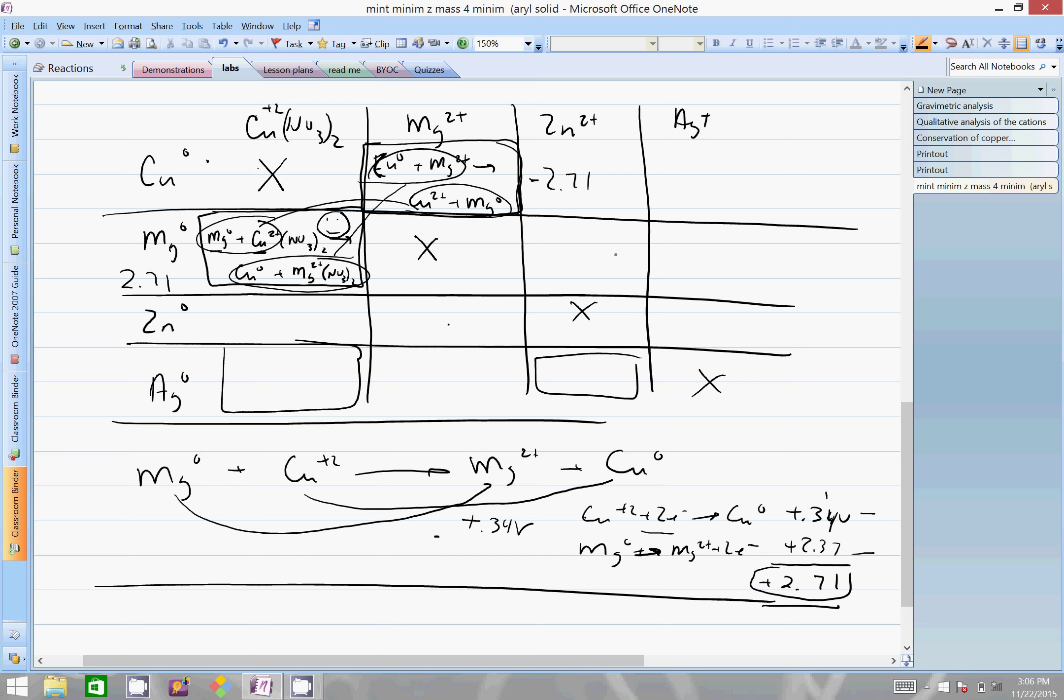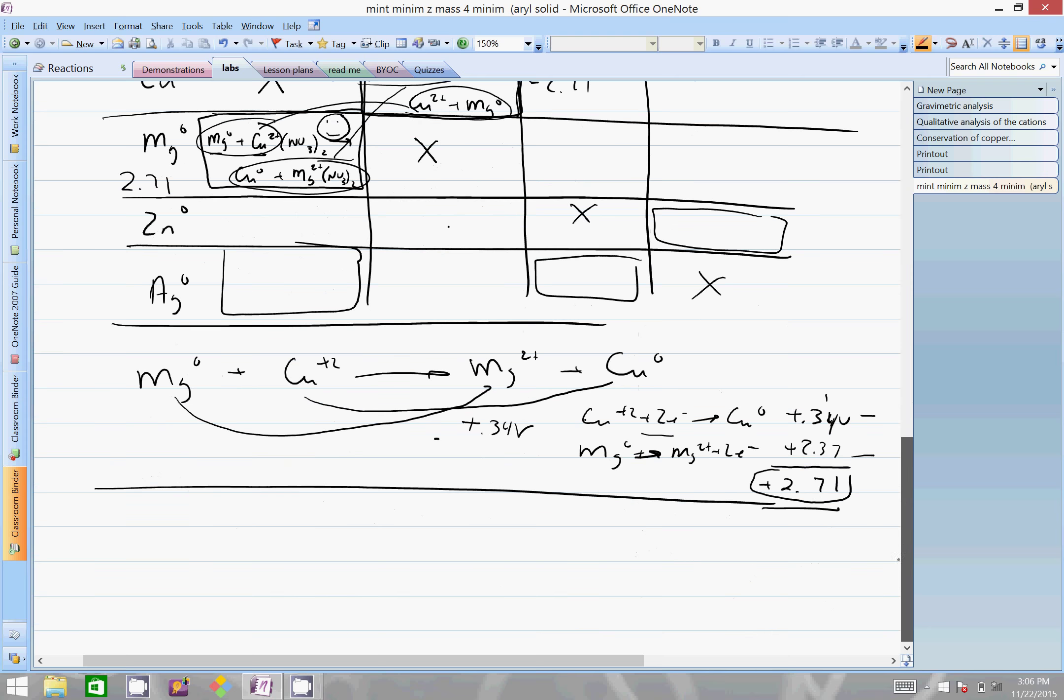Let's do the silver and zinc. Here's silver and zinc right here. I got my silver metal plus zinc nitrate 2+ goes to zinc metal plus Ag+. It's not balanced, so you put a two here and a two here, but I'm just worried more about the voltages than anything.